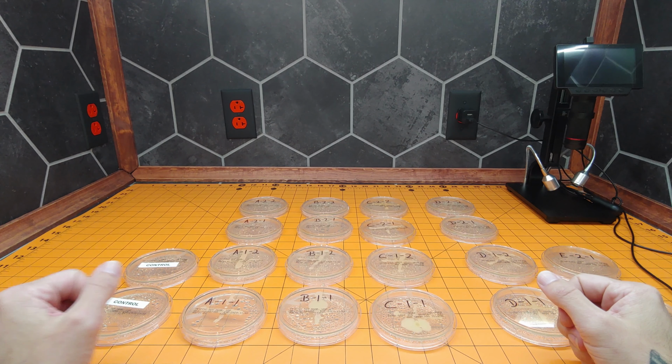We're back in the studio. The cultures have been in the incubator for 3 days now, and I just pulled them all out. I was planning on using the microscope, but it really isn't necessary for these. First, let's take a look at our control samples. As you can see, nothing has grown.